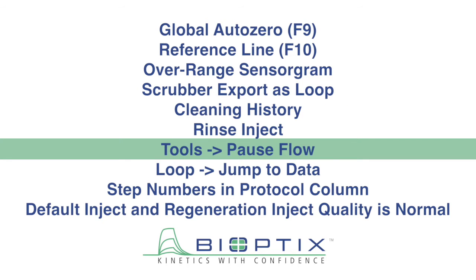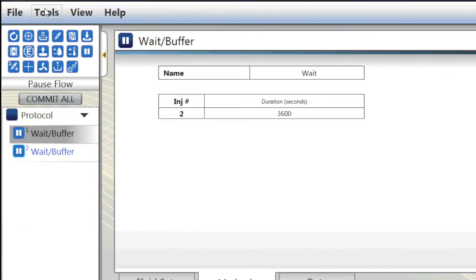You now have the option to pause the flow of buffer during an experiment in order to change or add buffer.